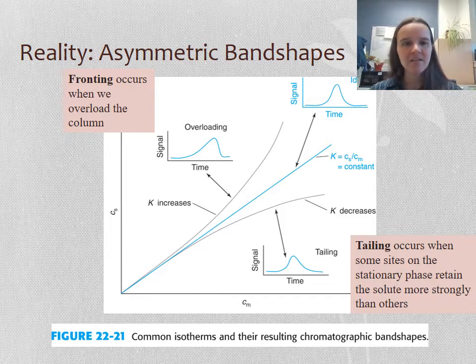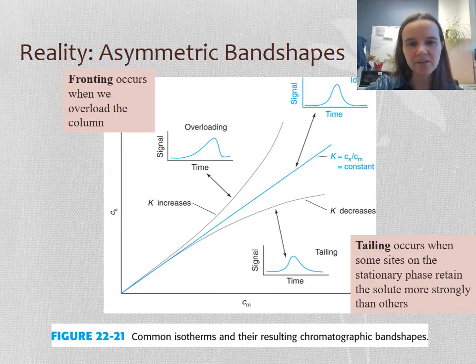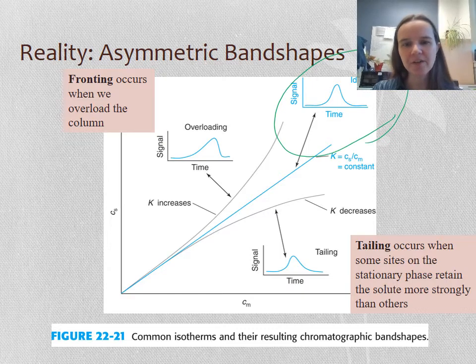One more thing on the resolution side of things is asymmetric band shapes. So ideally, you have this good symmetrical shape here.